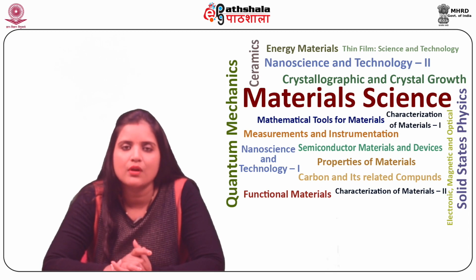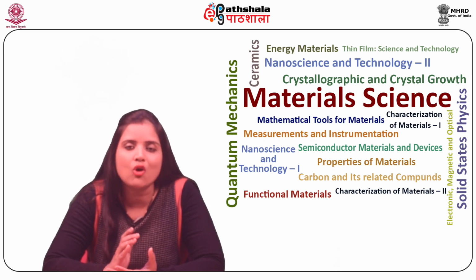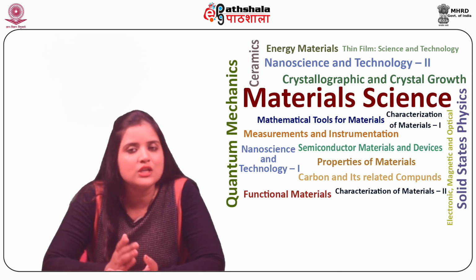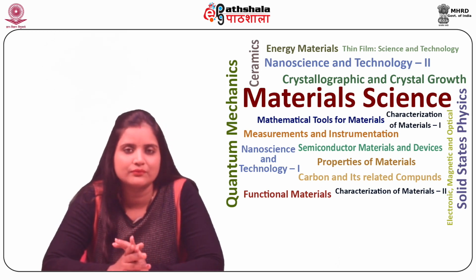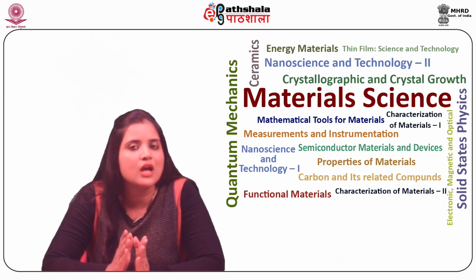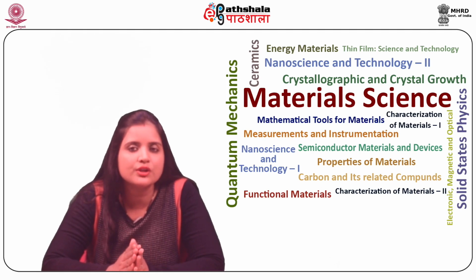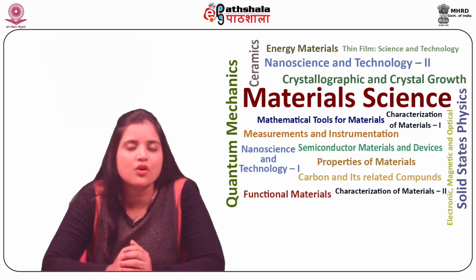Due to the limited instrumental techniques of his time, Synge's vision would have to wait for over 50 years. With techniques developed for the scanning tunneling microscope, Dieter Pohl et al. developed the scanning near field optical microscope, also known as SNOM or NSOM, in 1984, whose resolution goes well beyond the Abbe barrier. Present-day SNOM designs closely resemble Synge's original idea, as hundreds of research groups throughout the world use SNOM's combination of optical characterization with nanometer spatial resolution to investigate a wide range of surfaces.